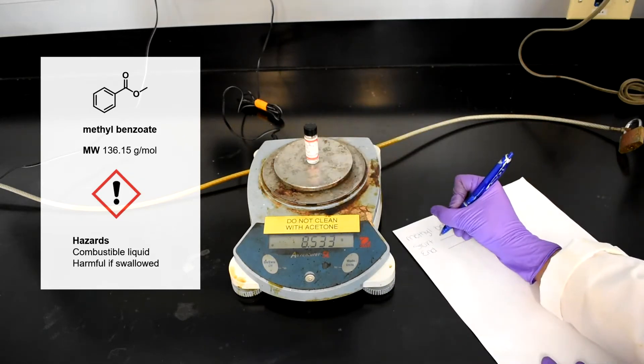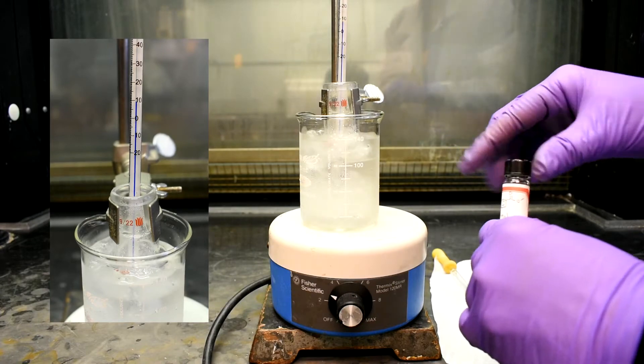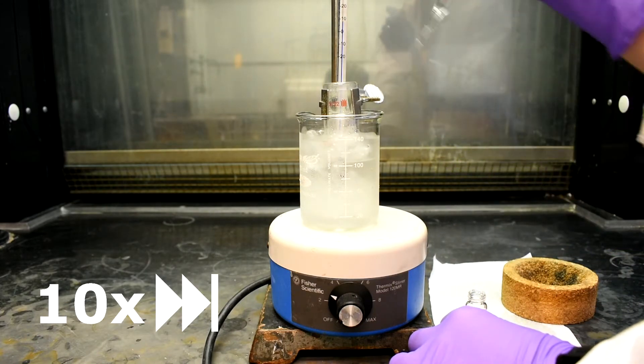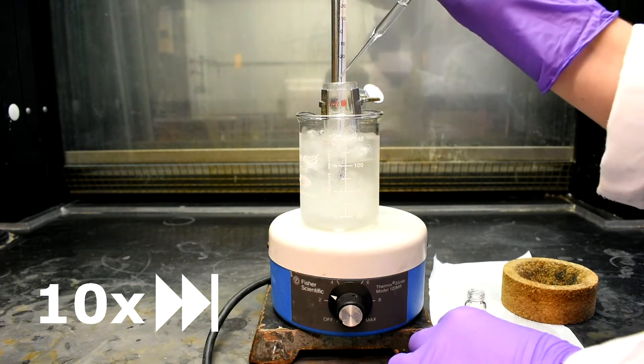Make sure your TA is present to sign your practical performance report. Ensure that your reaction mixture is below 10 degrees Celsius. Slowly add the methyl benzoate drop-wise over the course of 10–15 minutes by adding 4–5 drops at a time, mixing it thoroughly between each addition.